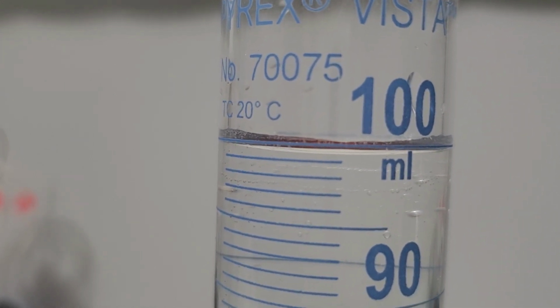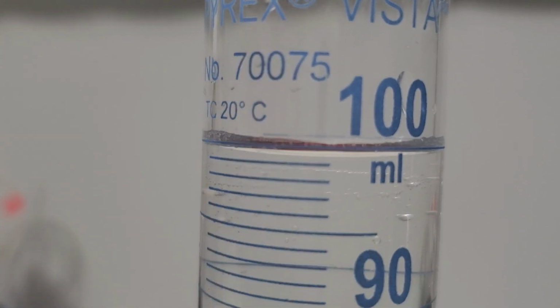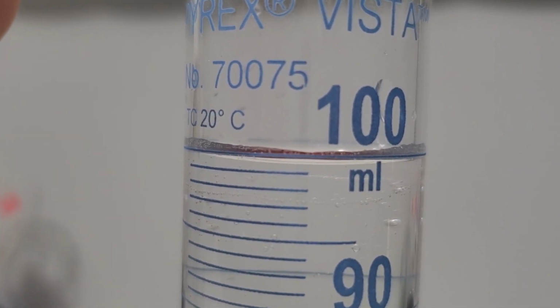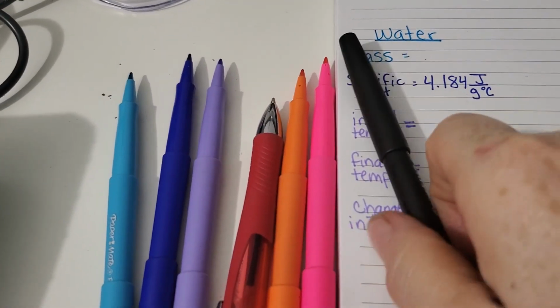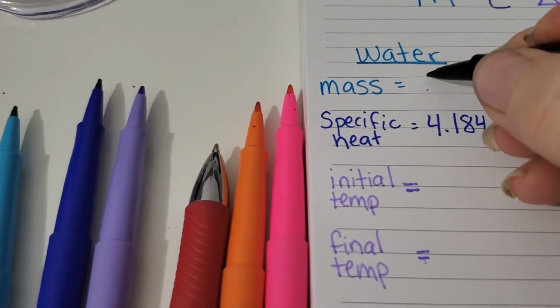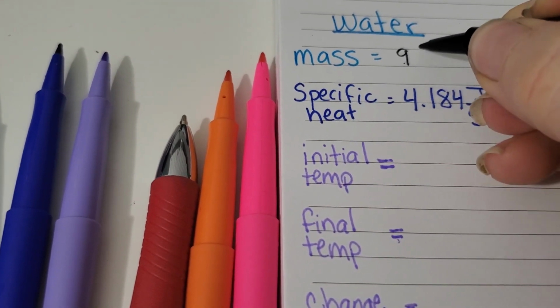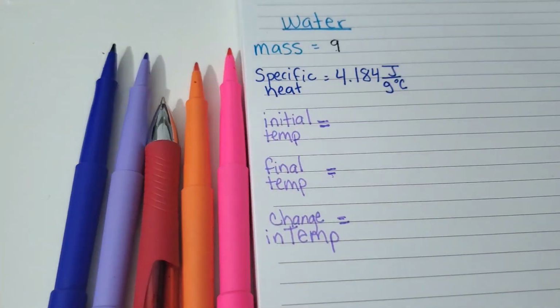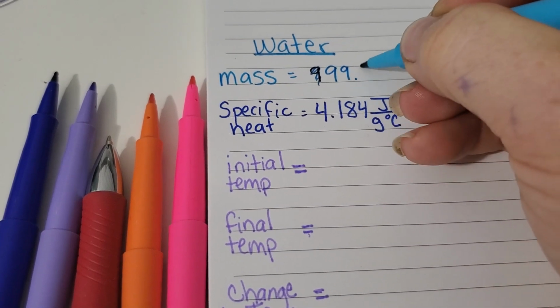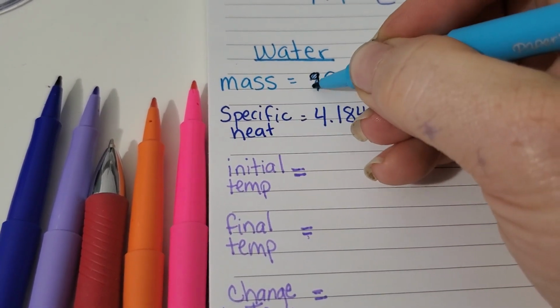So I'm gonna say that that is 99.6. And 1 milliliter of water is equal to 1 gram. So I can say that we have 99.6 grams.